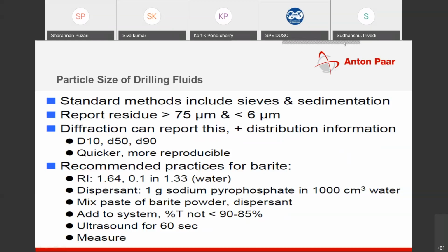analysis tool. Similarly, the sedimentation technique is now also very old. The sedimentation technique takes a lot of time. It's a time-consuming technique. Bigger particles settle down. Basically, in sedimentation, when you put the sample in, it starts settling down. So you take the timing of sedimentation, by how much time it has settled.